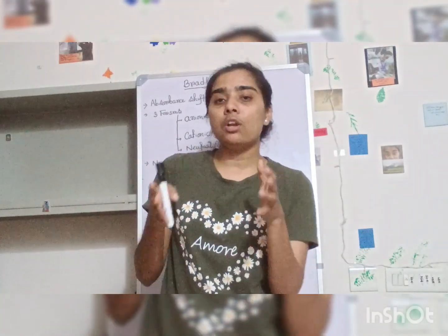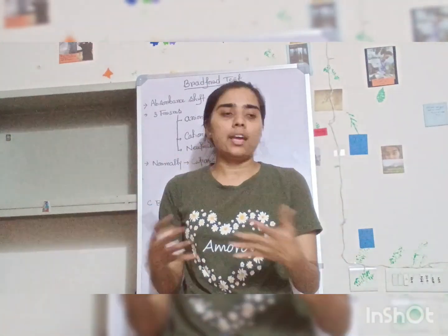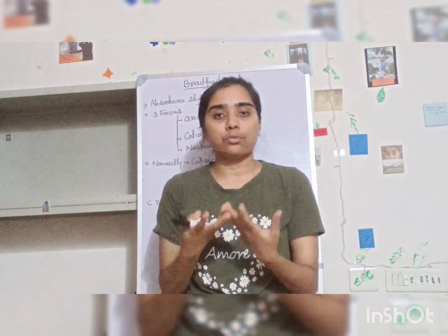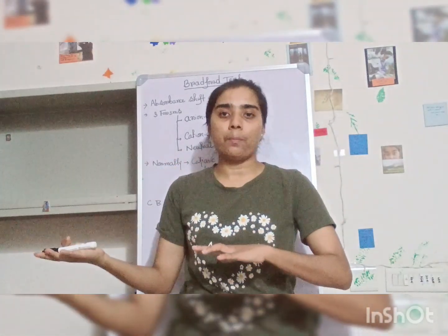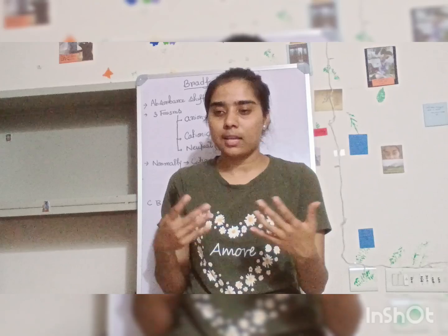First we'll look at the theory part: how the Bradford assay works, what the Bradford assay is, and how we can measure the concentration of your protein. Those questions we will try to solve first, then we'll go to the experimental part, the lab part. Bradford is the name of the scientist who discovered this technique, this assay.